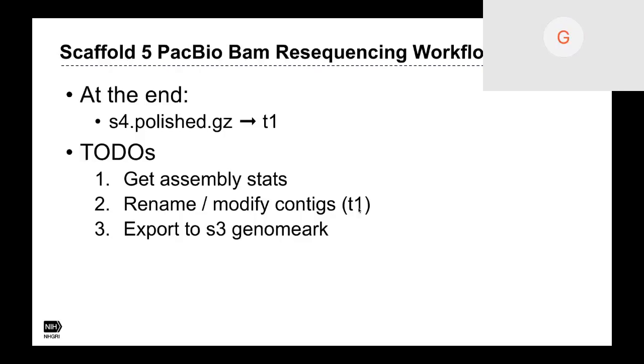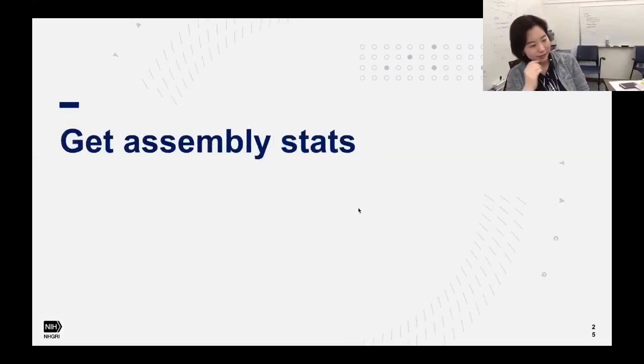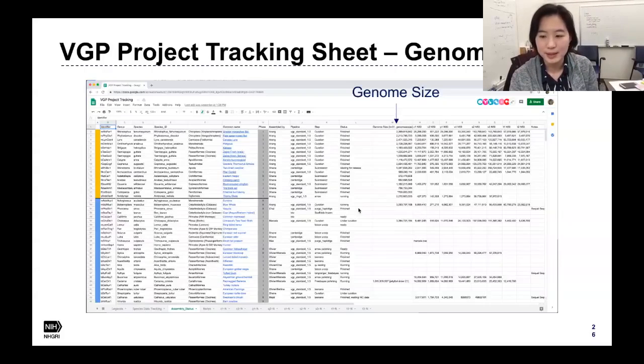Just a quick question: do you have more training material today that we can talk about, like how we're going to inspect the HiFi or how we're going to inspect the Hi-C or Bionano results? Oh, okay. I don't have slides of a Hi-C example, but I can add that maybe at the end.